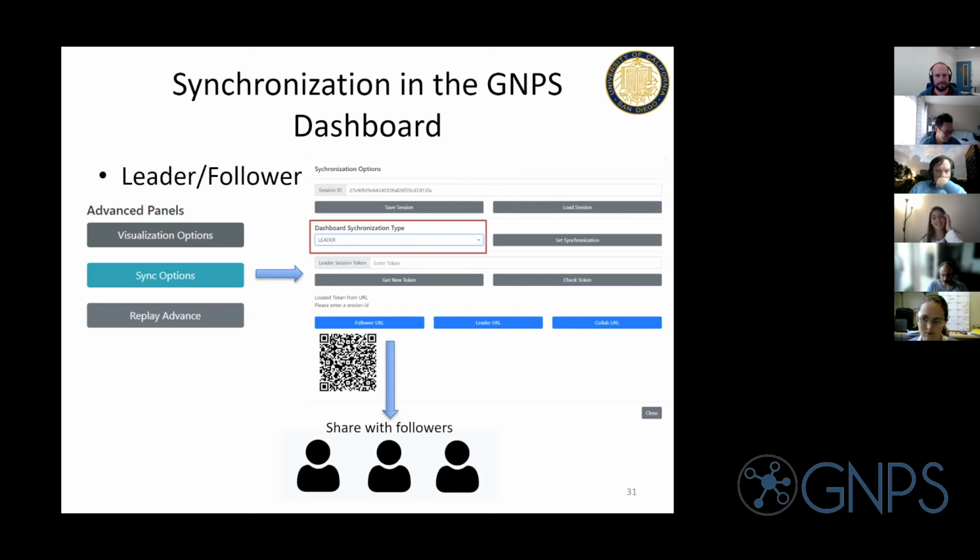So this is a URL you can follow that you can hand out, and then as you change anything in the interface, your followers that are on the same page will see that result. So that's kind of the first thing. And there's a couple other things that you can do for security's sake. You don't want followers to be able to hijack the session, so you can generate these unique random tokens. That's in the documentation, but we won't go into the details here.